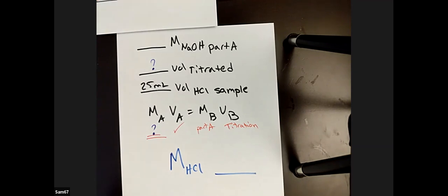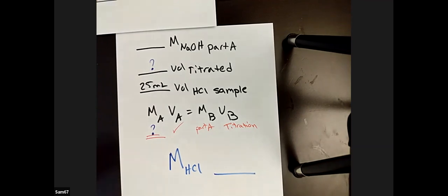All right, so now we're going to switch over to the simulator. All right. So let's look at the simulator here.